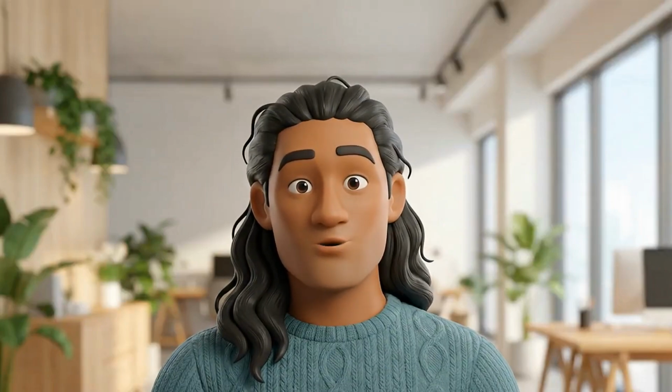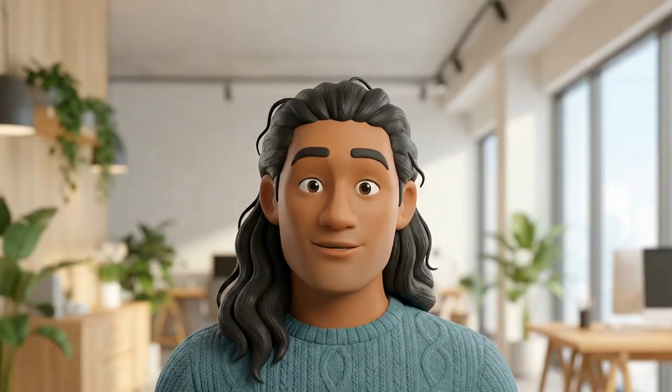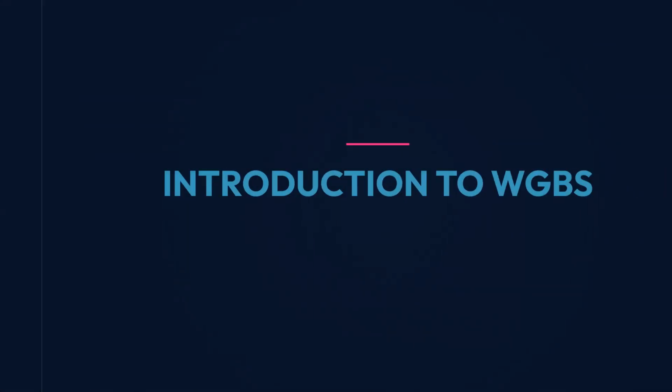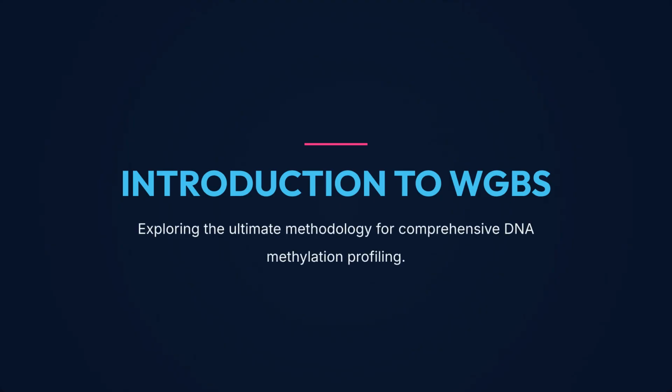Welcome to this video on the principle of whole genome bisulfite sequencing, or WGBS, a powerful technique for unlocking the epigenome at single-base resolution. This section provides an introduction to WGBS, exploring the ultimate methodology for comprehensive DNA methylation profiling.